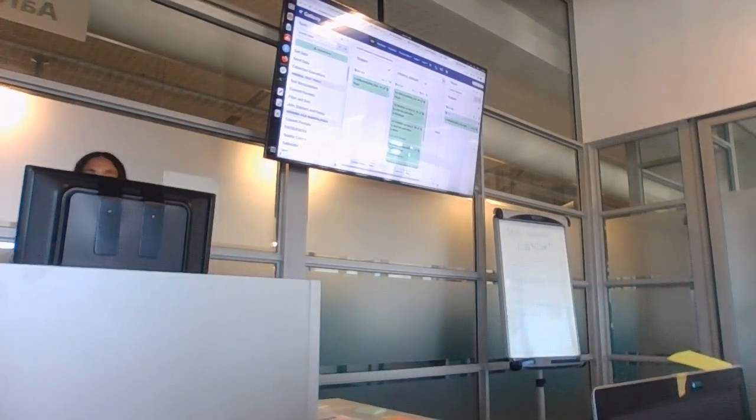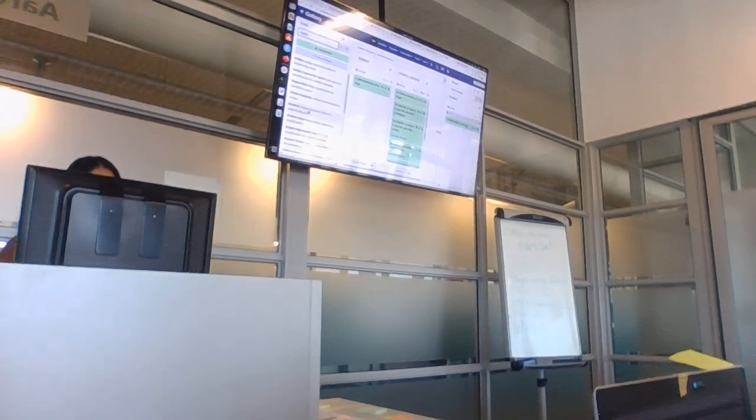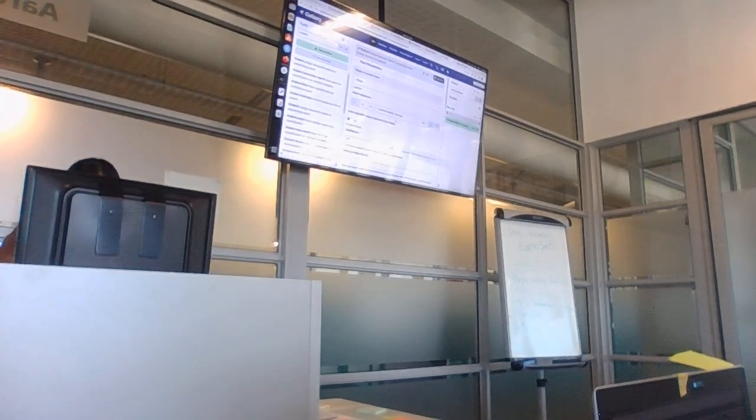Okay, so technically speaking, you should now be able to search for Kraken 2. Kraken 2, not Kraken. I can't remember the difference. It's probably just updated. And you should be able to.